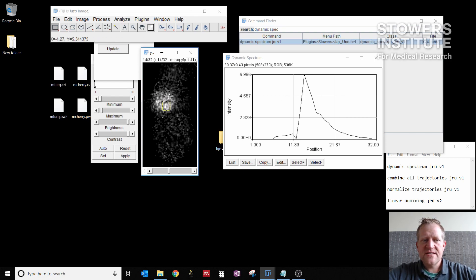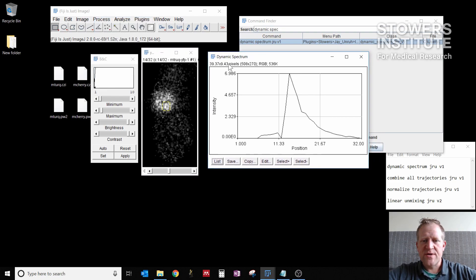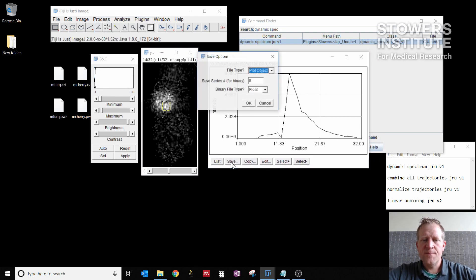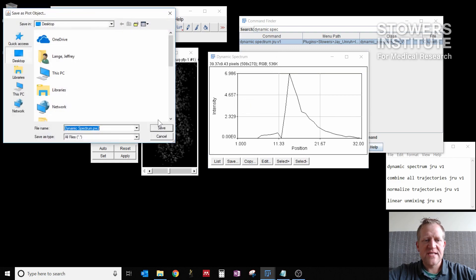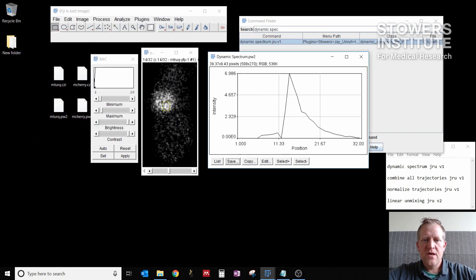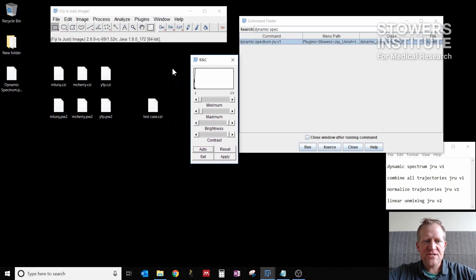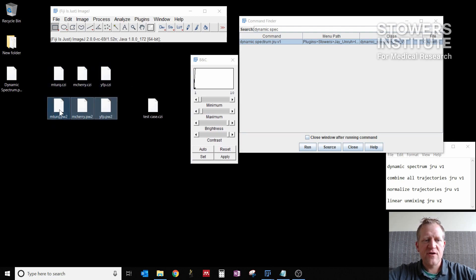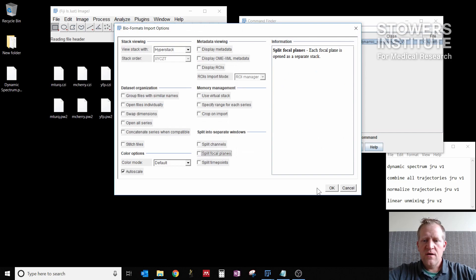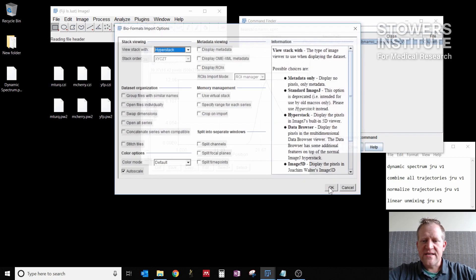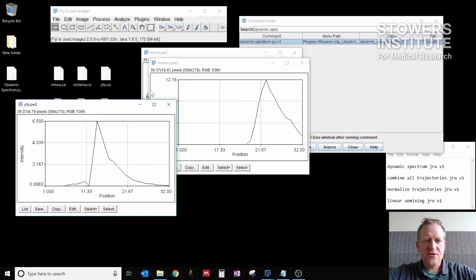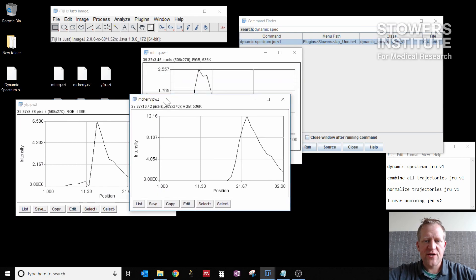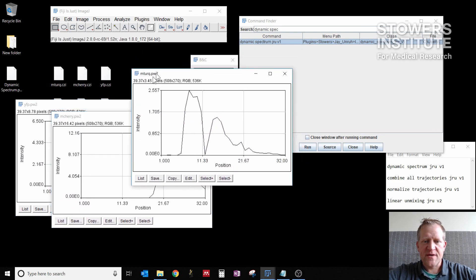Once I have this, I can click quit here on the plugin. And now I have this window, I can save it here, use these settings as your default, and then click OK. You can save this wherever you need to as a plot window, a PW2 file, that's important. So I go through and do this for each of the three control images that I have. So now I have three different control spectra. I go through and open each of these. You can see my YFP spectra, my mCherry spectra, and my mTurk spectra.